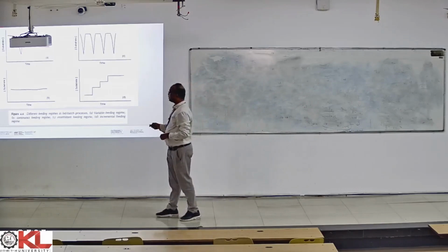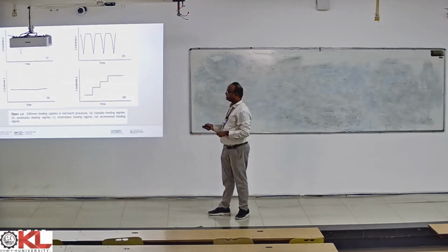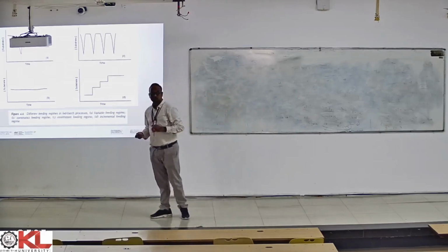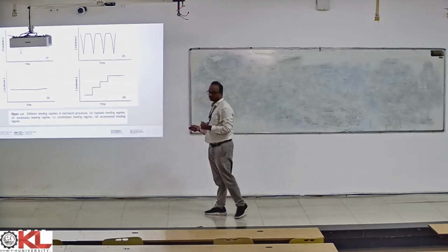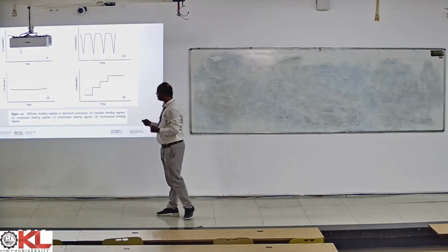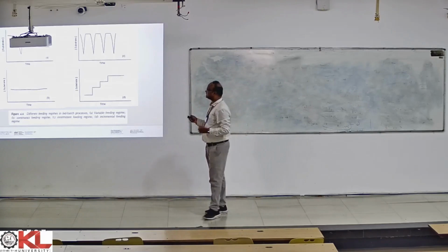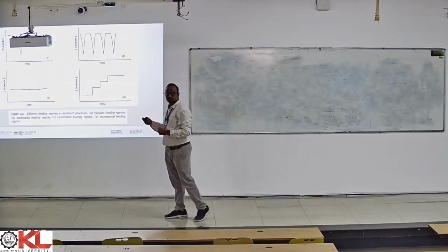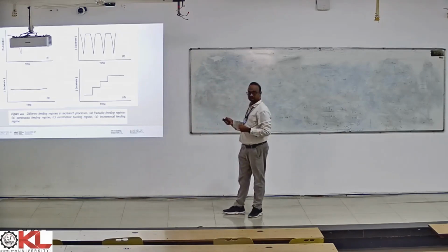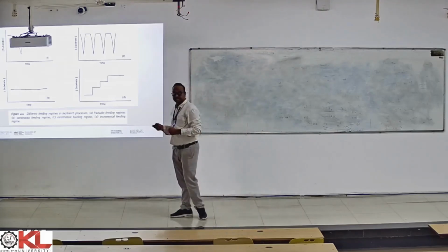The second mode of operation is called the continuous feeding regime. Here in graph B, we slowly send the substrate at minimal concentration continuously into the bioreactor. This is also one way of operating in a fed batch mode. The third one is called the intermittent feeding mode. If you have a look at this graph, we are feeding at different time intervals. We give a break and then send the feed again. Such feeding is called the intermittent feeding regime.